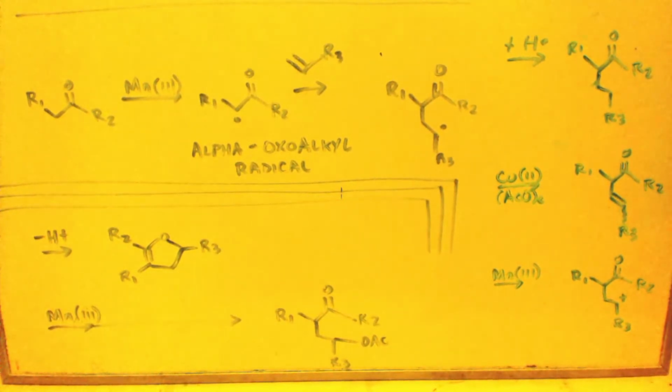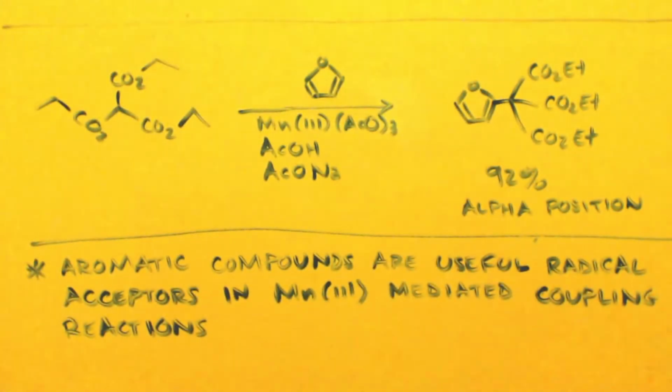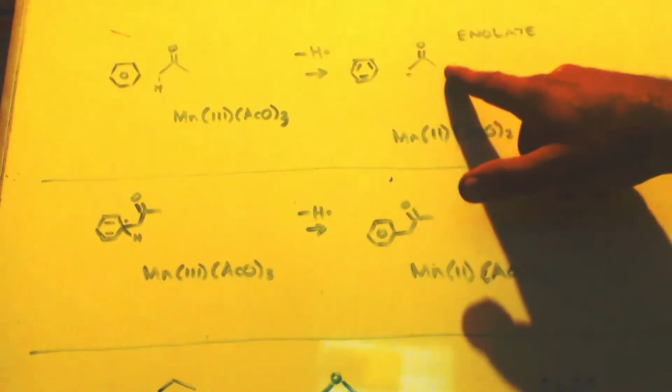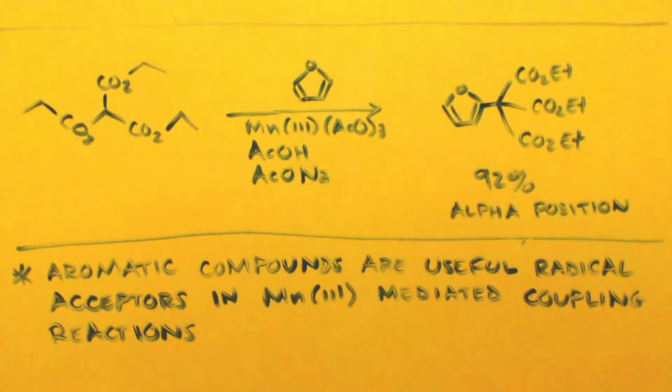It's not just to make P2P. There's a million other experiments that you can do. I remember how I said in the one reaction that it makes a type of an enolate free radical, right? So this reaction works on enolizable carbonyl compounds really well. Okay.